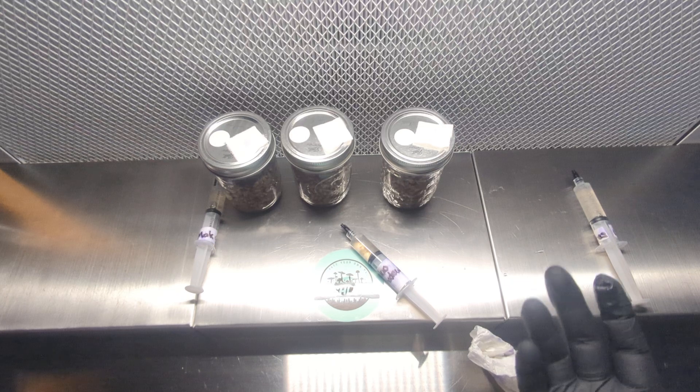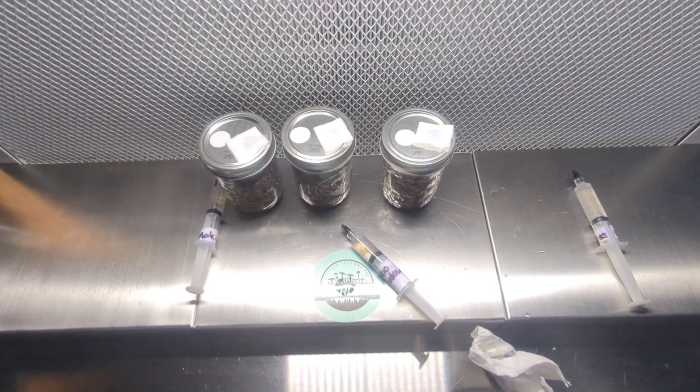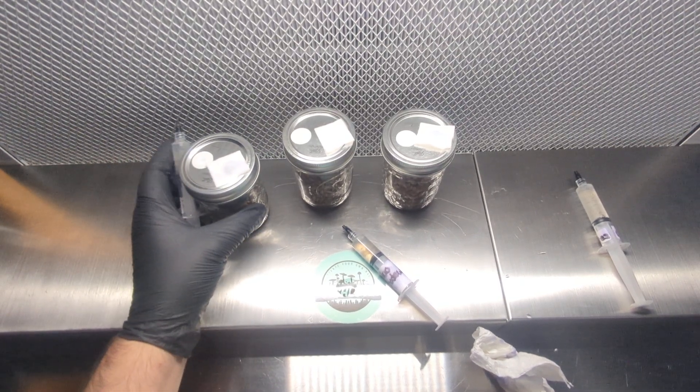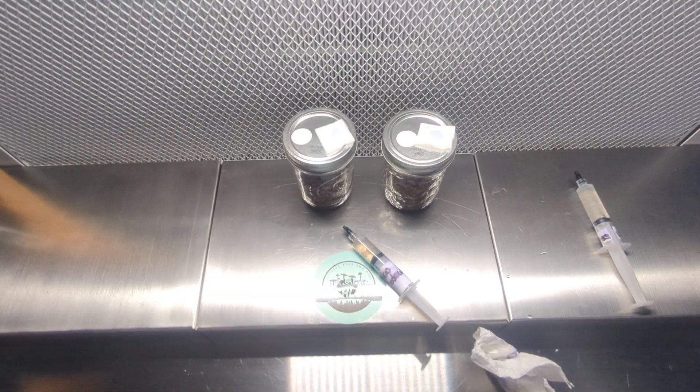You want to make sure you don't get your jars mixed up. I don't have the labels ready for them yet, but I'm just going to put them to the side with the syringe next to each one so I know which is which.